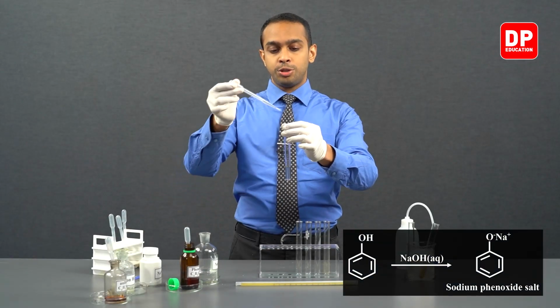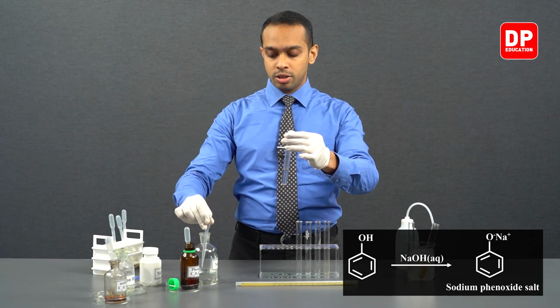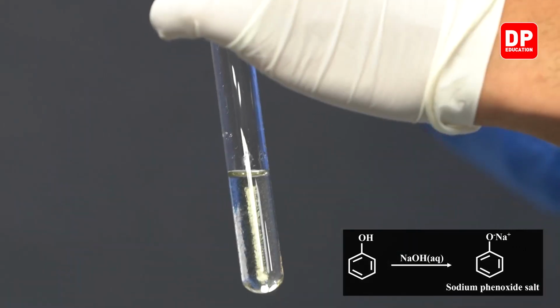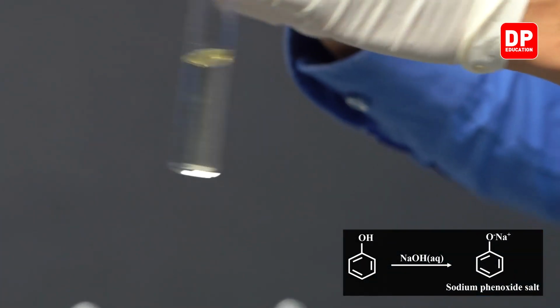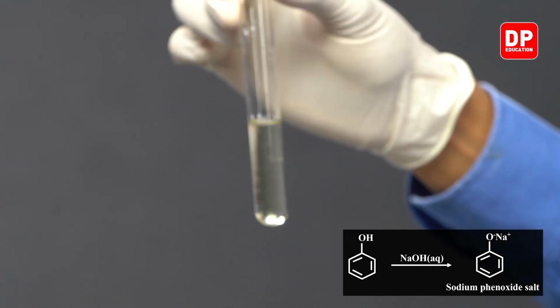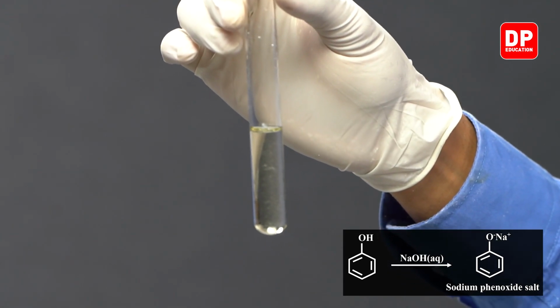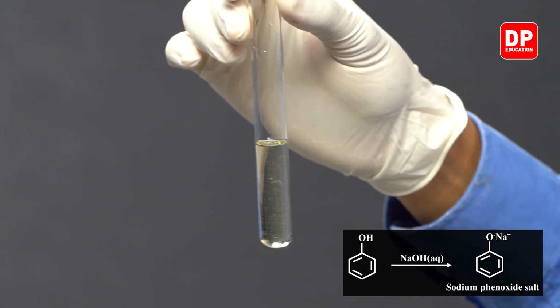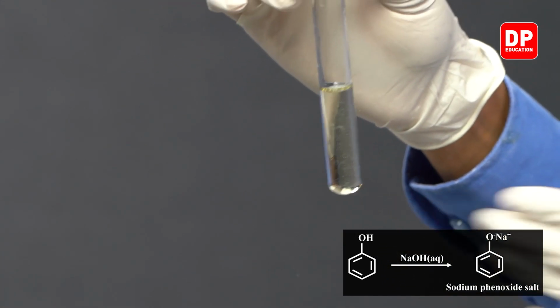Now, as you can see, when we have added around 5 milliliters of sodium hydroxide, all of the phenol dissolved in the sodium hydroxide and formed a solution. Phenol is acidic in nature, and when you react sodium hydroxide with phenol, we produce sodium phenoxide salt, which is soluble in water.